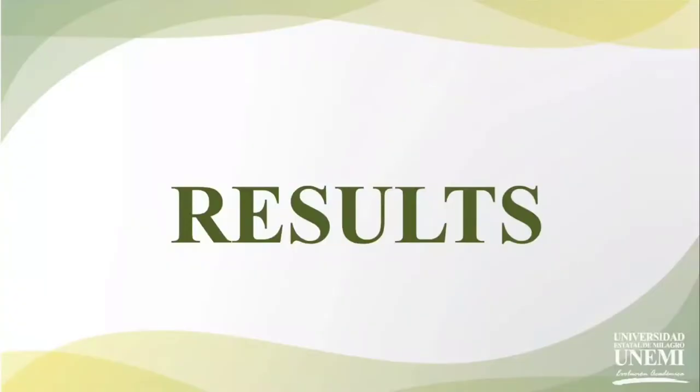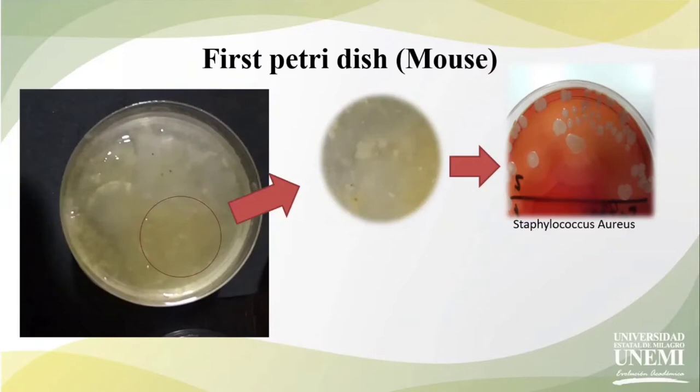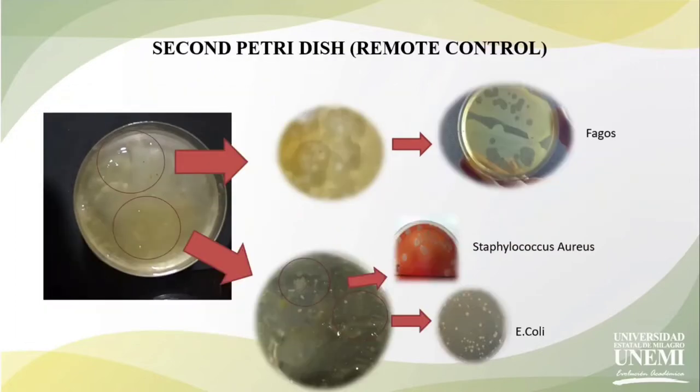Results: in the first plate we have the mouse sample and we can observe that there is presence of Staphylococcus aureus. In the second plate we have the remote control sample and we can observe that there are two bacteria present: Staphylococcus aureus and E. coli, but also there is presence of phages.